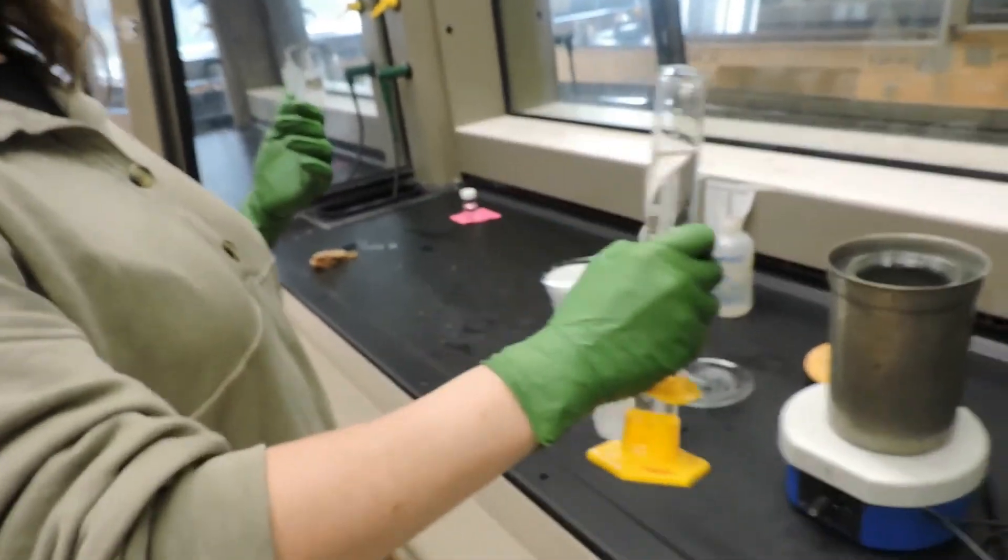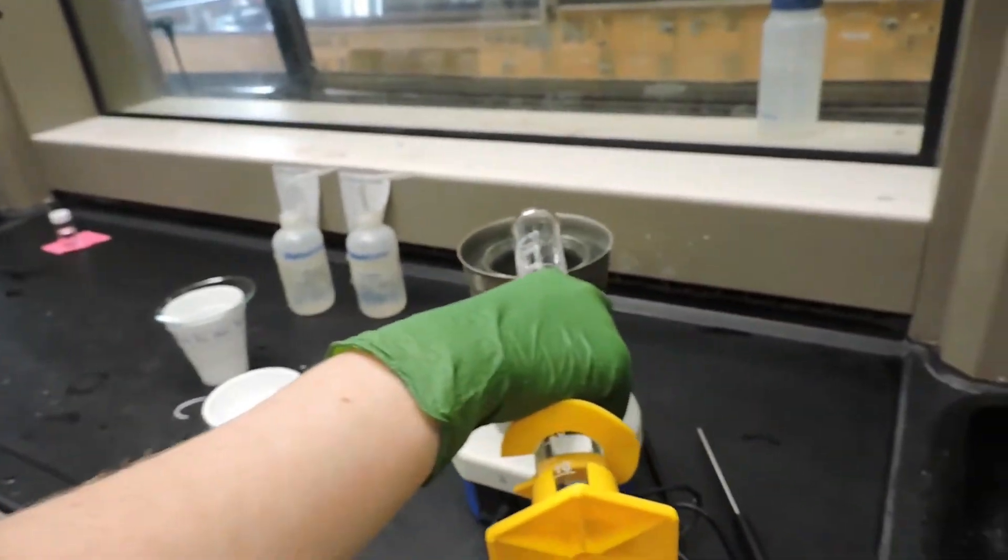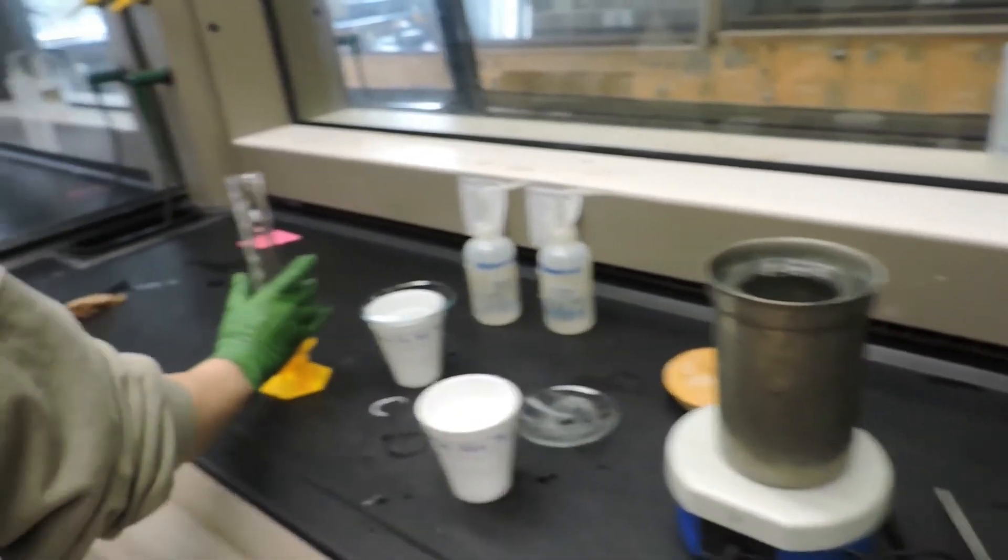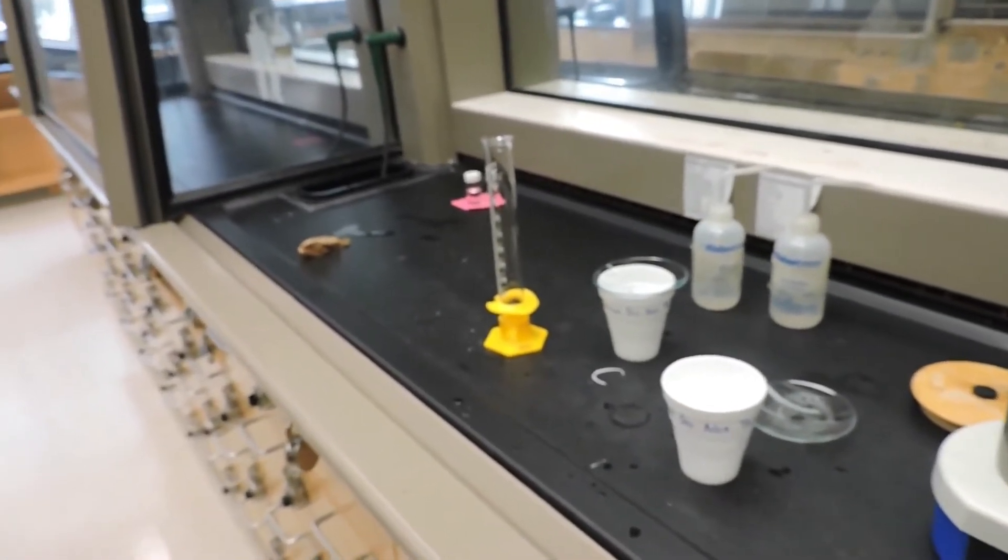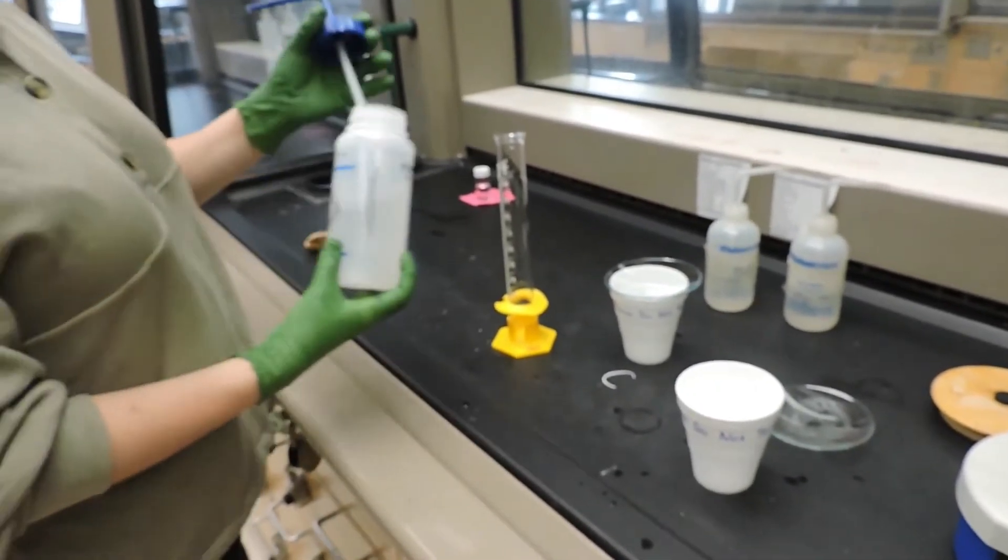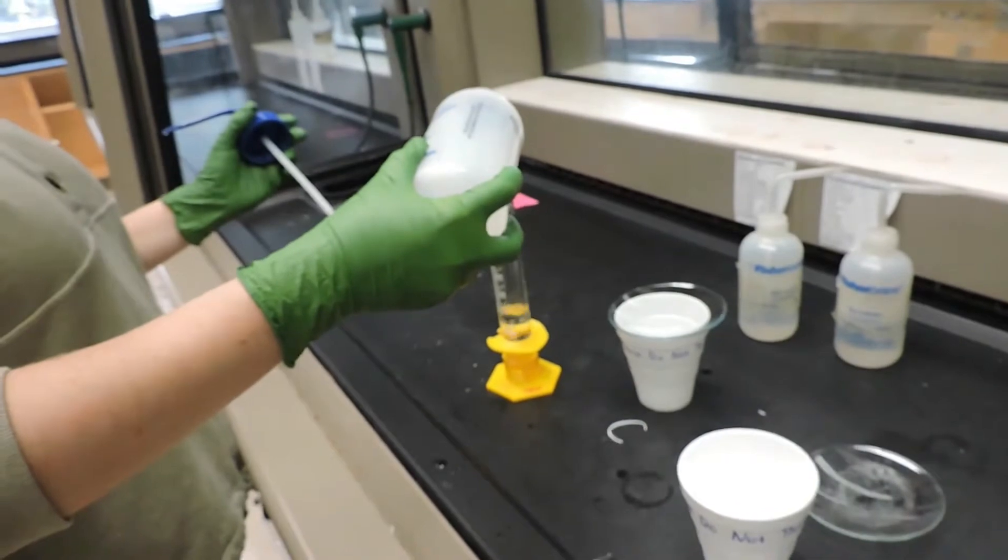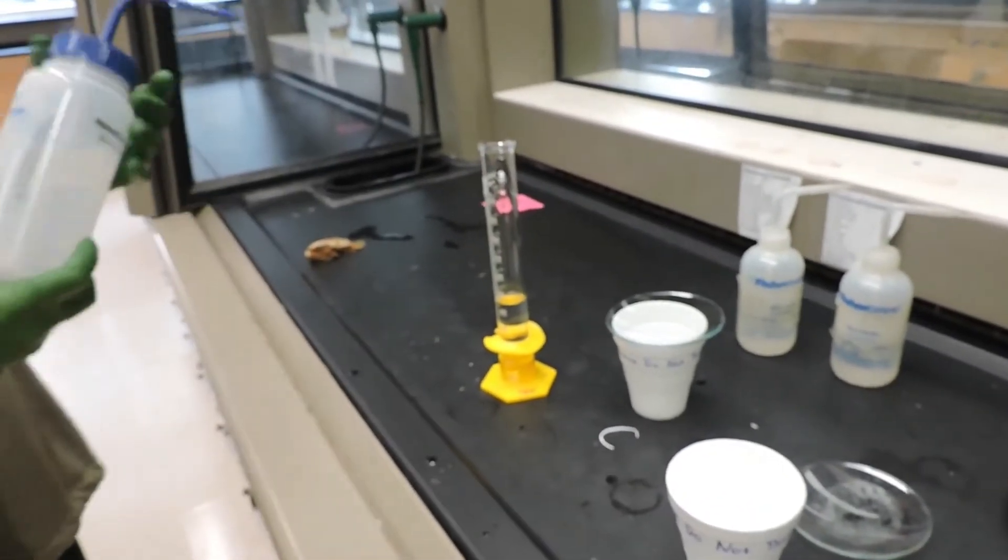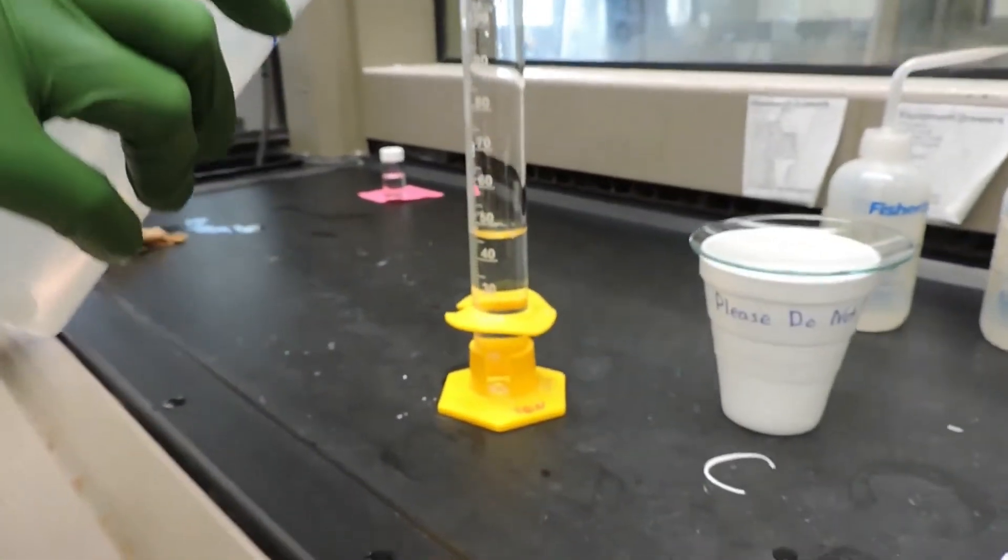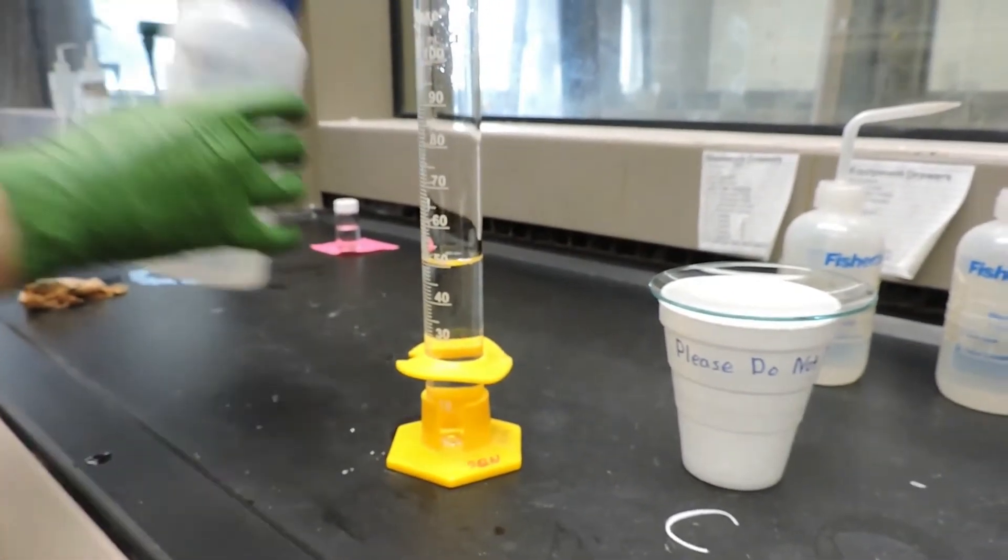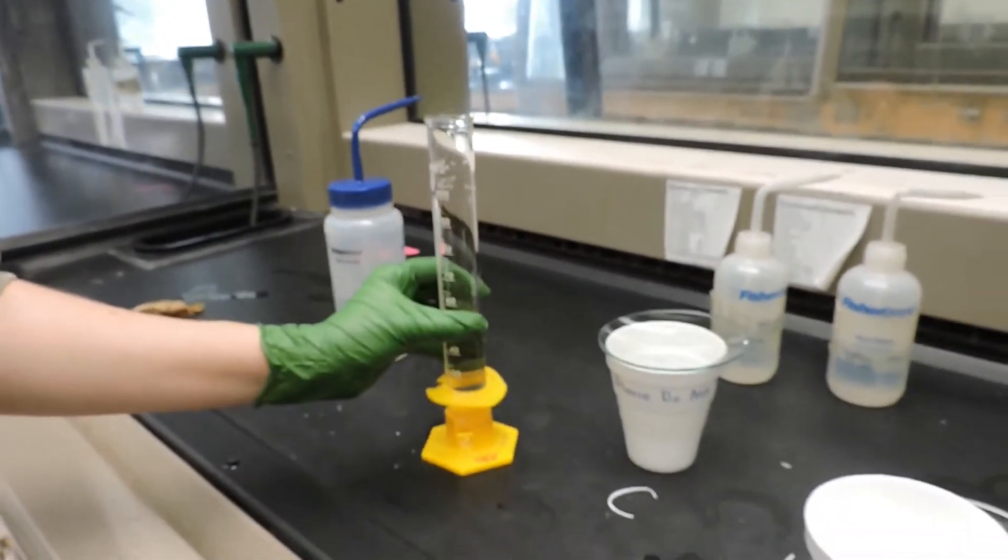We'll carefully measure 150 milliliters of deionized water using a 100 milliliter graduated cylinder. So that was 100 mils, and now we'll add an additional 50 milliliters. It's all about the meniscus.